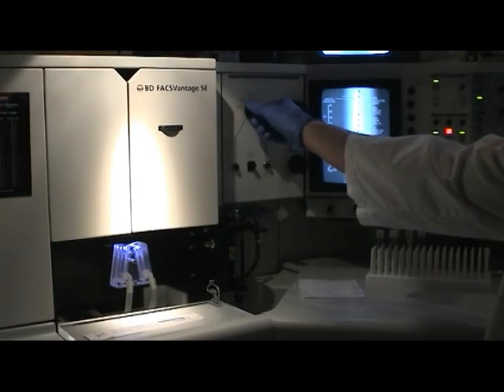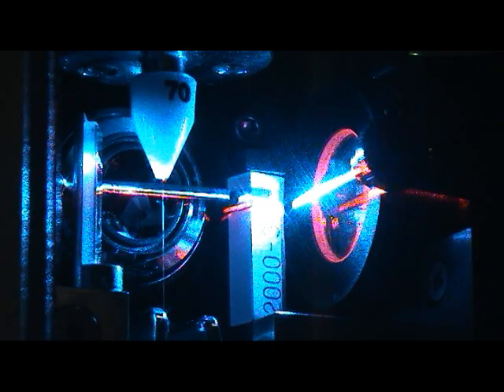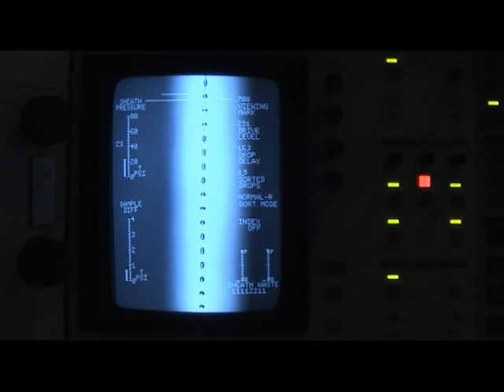With the cells moving along in single file, we're able to focus a laser beam on that stream, as well as additional lasers. This point is called the laser intercept. When a cell passes through the laser intercept, it blocks and scatters light.